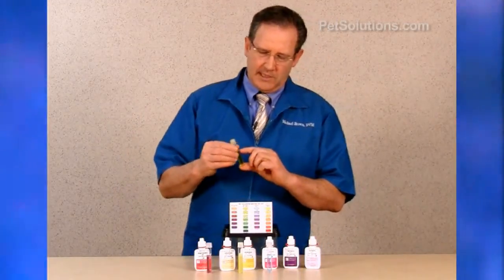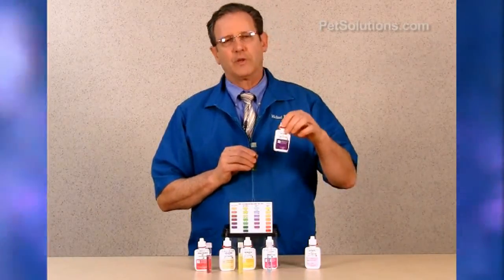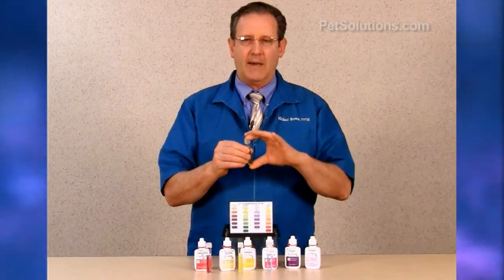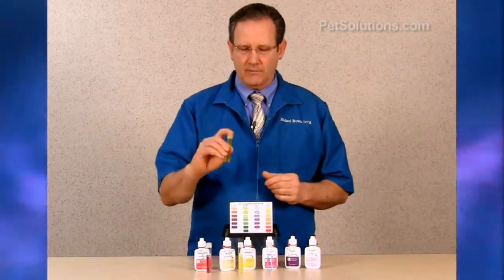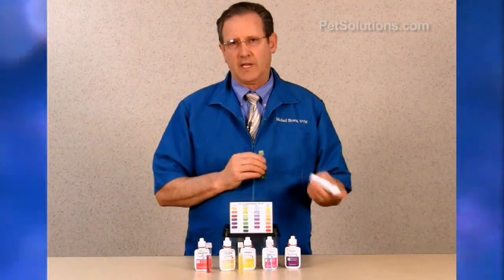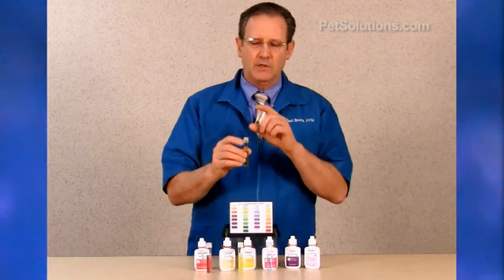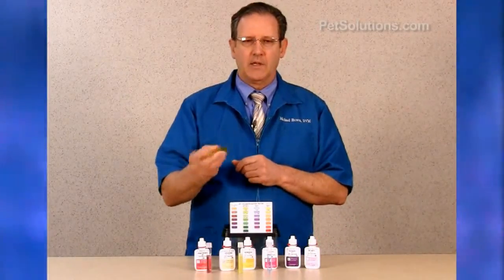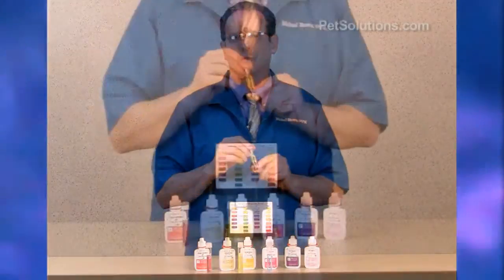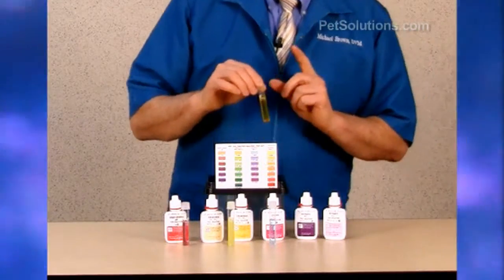To measure nitrate levels, fill a clean test tube to the line, 5 mLs. Take nitrate bottle number 1, put 10 drops in, cap and invert. Shake bottle number 2 vigorously for about 30 seconds before using, then add 10 drops, cap, and mix for about a minute. Wait about 5 minutes for the color to develop, then compare it to the color chart. This one is at zero.